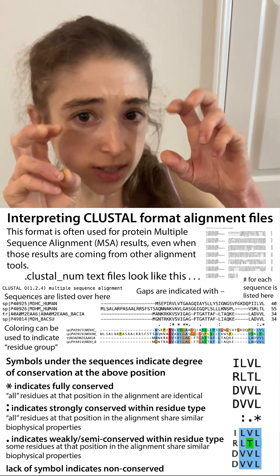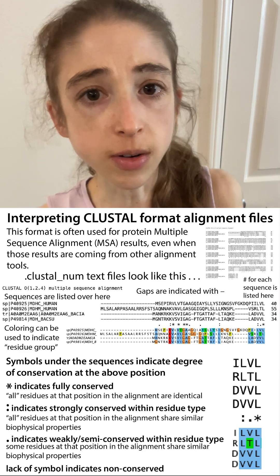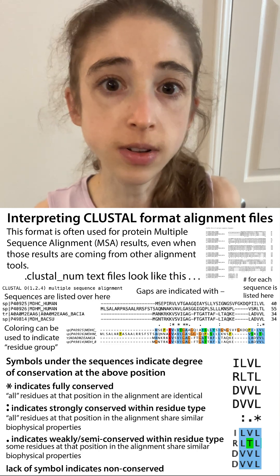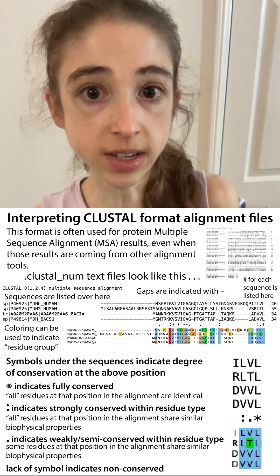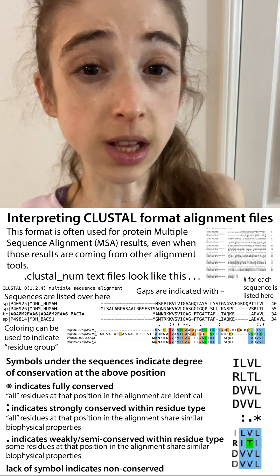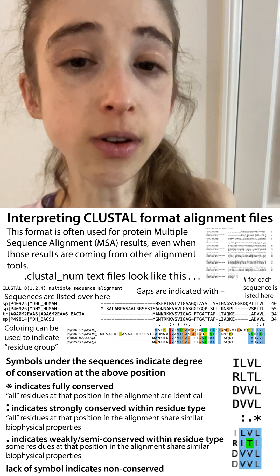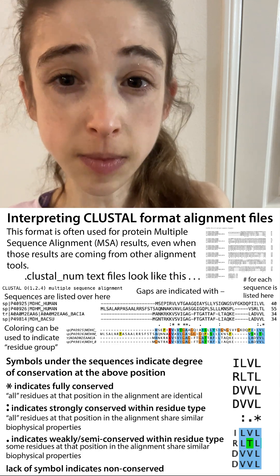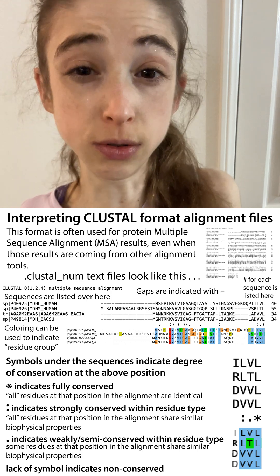When scientists want to get a look at how similar some protein sequences are, we typically start with a multiple sequence alignment or MSA tool, and then we want a visual readout of the similarities and differences. Often this is done with Clustal formatting, so you might have a Clustal text file as well as Clustal color coding, even if the results aren't actually coming from the Clustal tool.